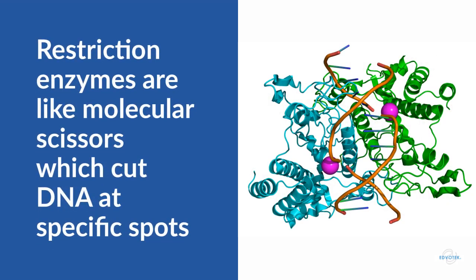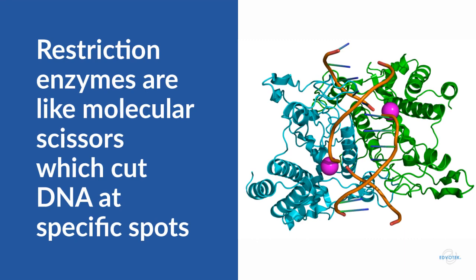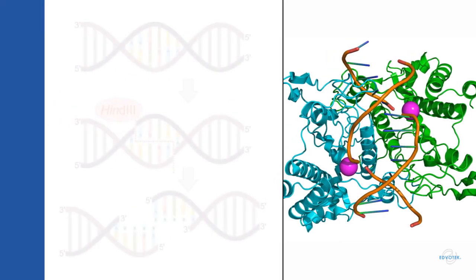Now, some of these SNPs create restriction fragment length polymorphisms, or RFLPs. So what does this mean? A restriction endonuclease is a highly specific enzyme that acts like a molecular scissor, cutting DNA into fragments based on its exact sequence. SNPs can create or destroy restriction enzyme sites based on their location within the genome.